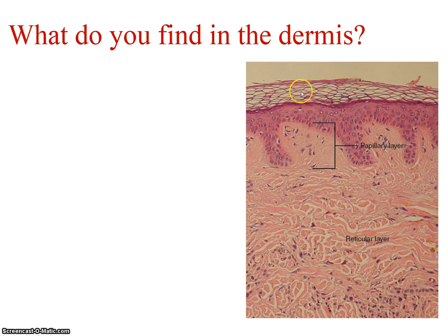It has this really strange appearance, but this is all stratum corneum. This of course is the stratum basale, and again epithelial, so it's cell, cell, cell. Here we get into the dermis, which is a lot of connective tissue, and this is basically dense irregular connective tissue, most of it, but we divide this into this papillary layer, which is that layer that comes up right and kind of projects into, in a sense, the epidermis, and then this reticular layer.